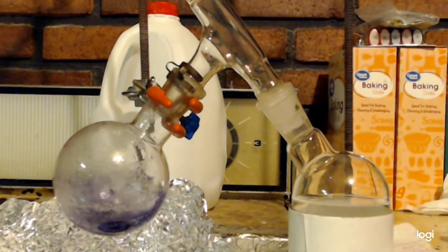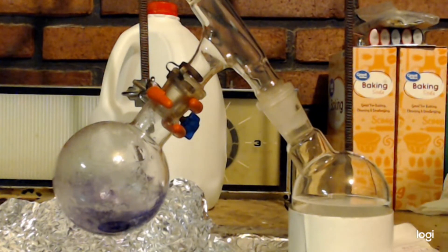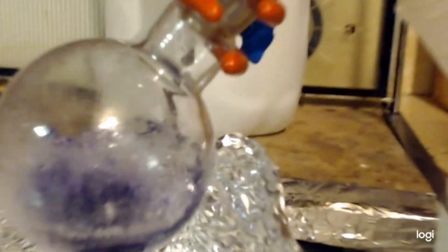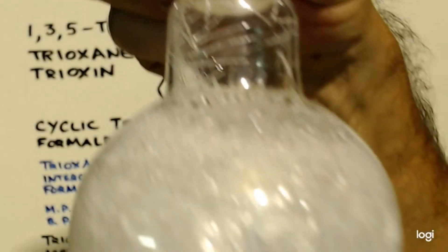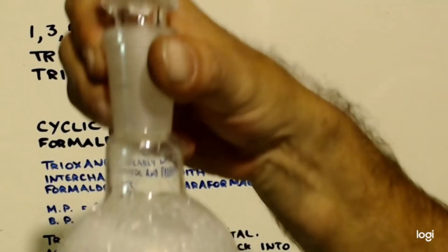Okay, that's it. I did it to dryness almost. You can see there's a little bit left in there. It's dripping back. So there it is. Those aren't cracks.